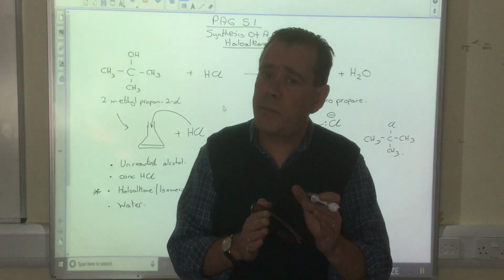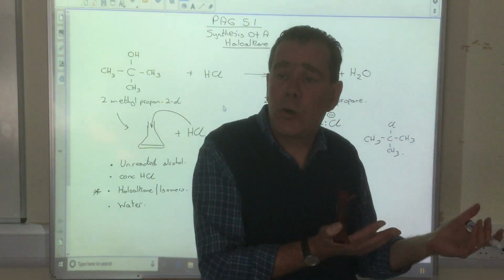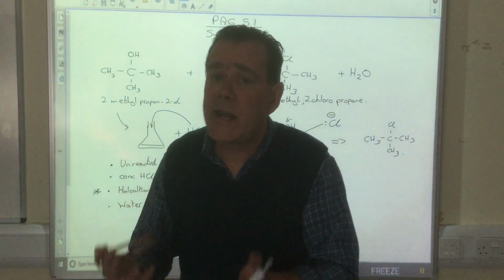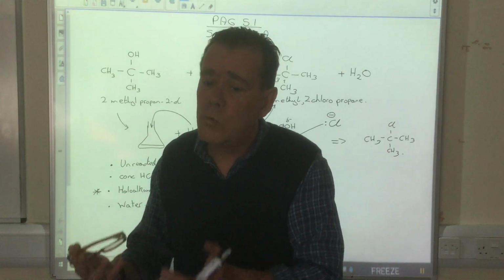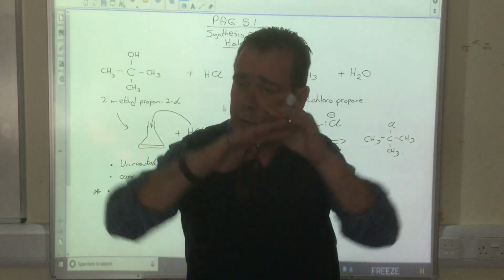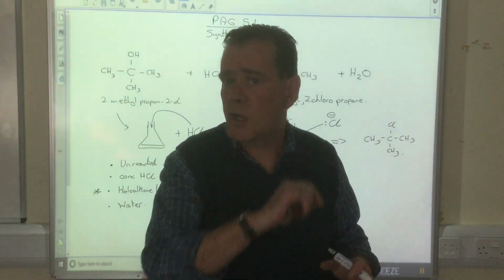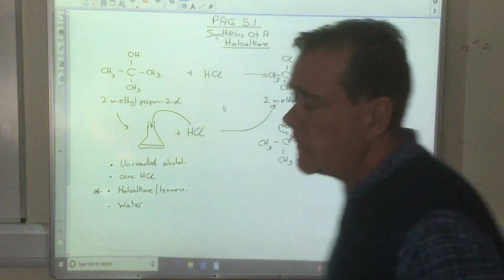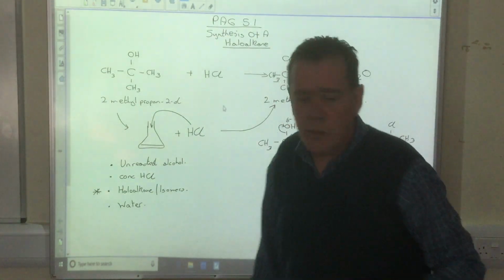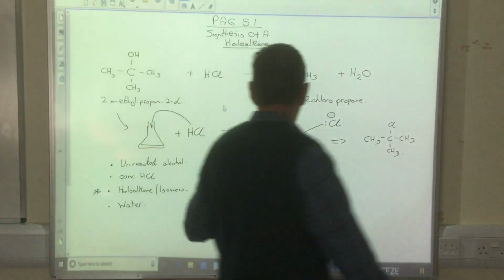Basically, you're going to use a separating funnel to separate water-soluble, aqueous substances and water-insoluble organic substances, and that's your first. If you ever get a mixture of those type of things, you have to use a separating funnel. First time we've ever seen this, guys. So let's take this and let's see. Now I'm going to keep this on the board, right? Because I'm not so sure about rubbing it all off straight away.